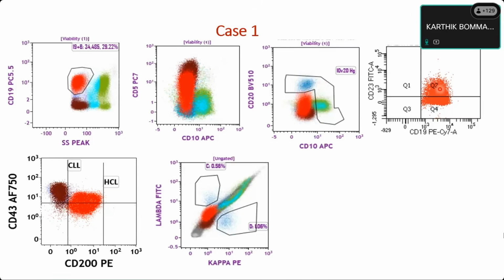And CD23 is positive or negative? Yes, positive. Okay, and CD200? CD200 is also positive, sir. Okay, because in comparison to your internal control. Yes, sir. I just want to extract words from you so that I can describe the pattern of antigen expression by flow that we discuss.